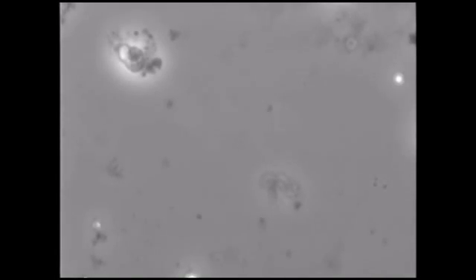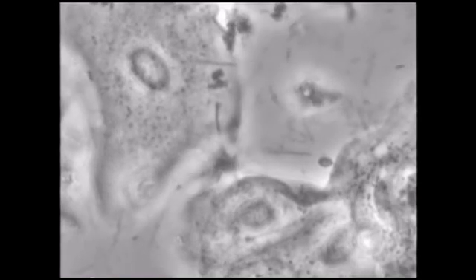In my practice, I use the spirochete as a barometer of the patient's home care and also my own hygiene department. After a normal cleaning, both at home and in the office, there should be no active spirochetes. In the center of the screen there are two skin cells, and between the two large cells is a white blood cell being attacked by massive spirochetes.